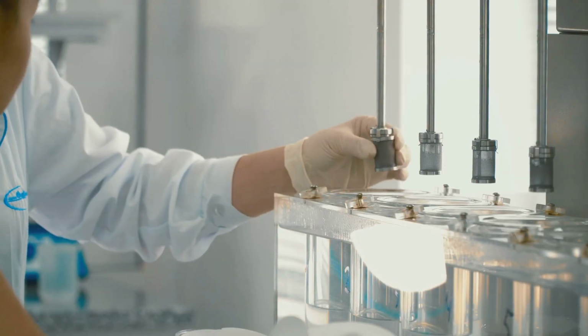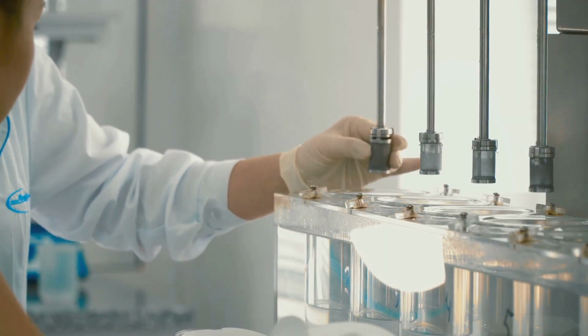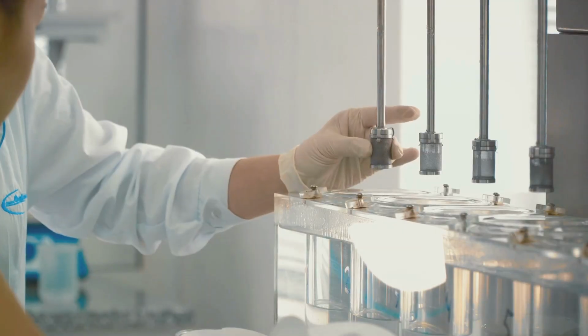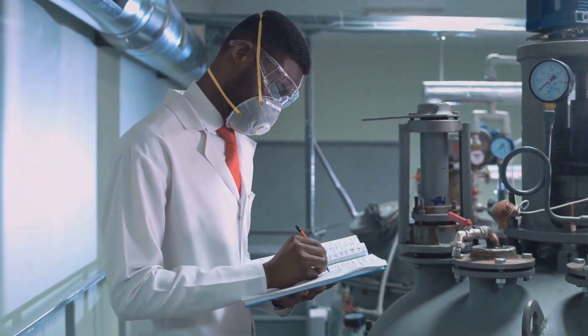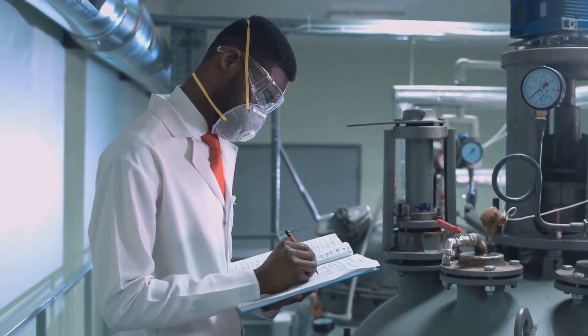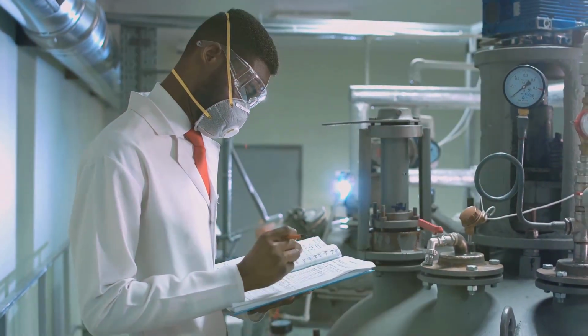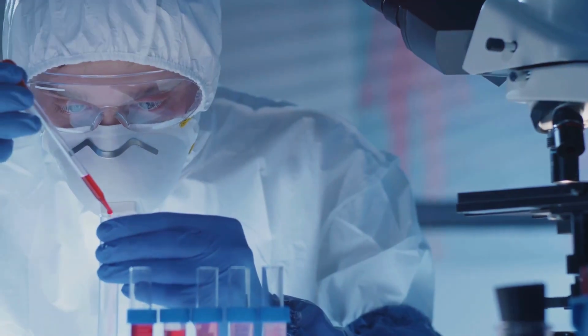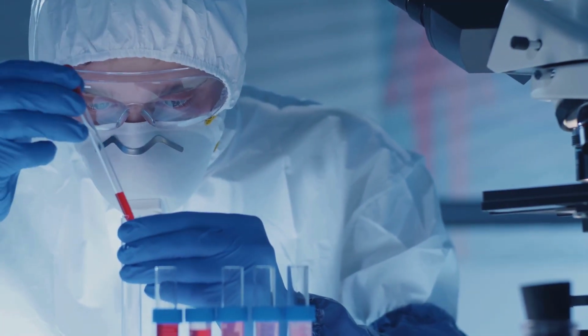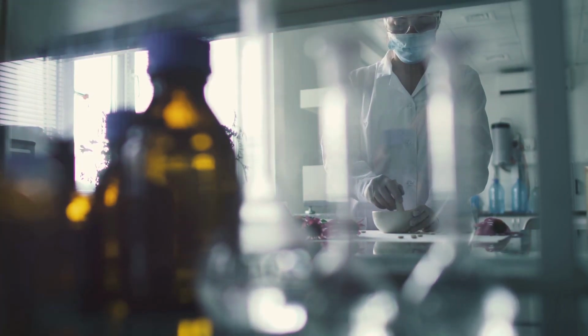Remember, CMC isn't fixed. It changes with temperature, pH, and salt concentration. Always match your buffer conditions to your experimental needs. Double-check your calculations and record every detail in your lab notebook or digital journal. Good records are key for reproducibility. Getting the detergent concentration right is absolutely crucial for experimental success and reliable results. Now, let's move on and design your buffer for optimal protein stability.